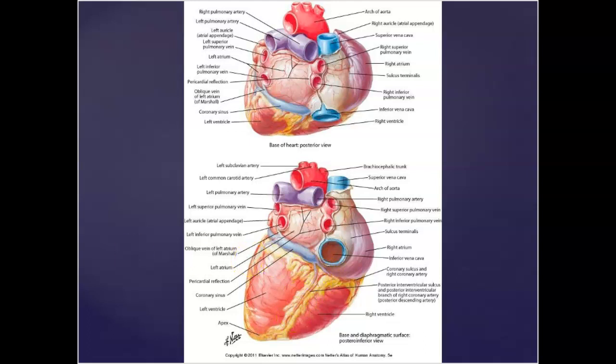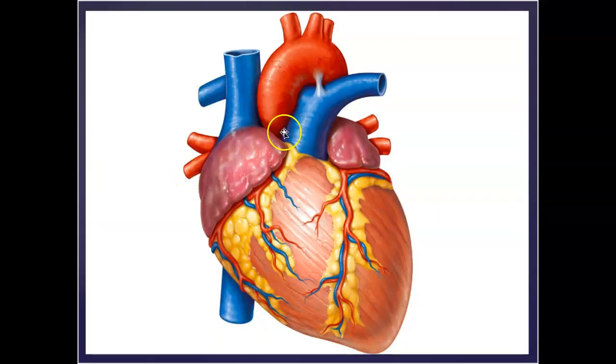The next thing you'll see is the left coronary artery. Now this is a little bit tricky because it's coming off of the aorta, again, right past that semilunar valve, and it comes behind the pulmonary trunk. So since you cut that off, you can tease that behind. You'll take a blunt probe and pull that away towards you, and you should be able to sneak back and see where that left coronary artery arises off of the aorta and comes behind the pulmonary trunk. Here's the auricle of the left atrium as it wraps around the back side of the heart and becomes that left coronary artery.